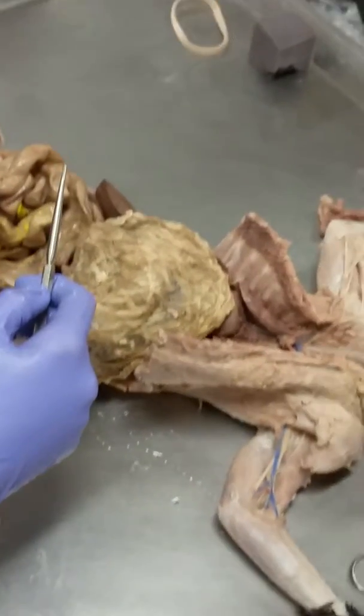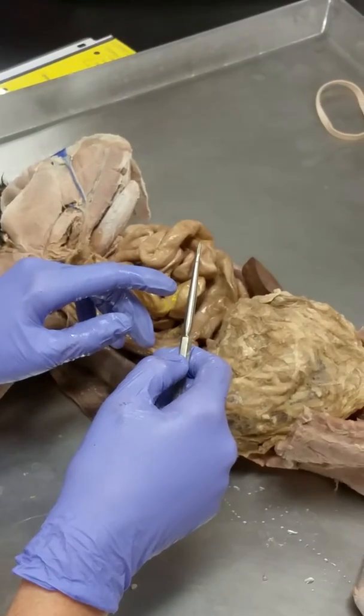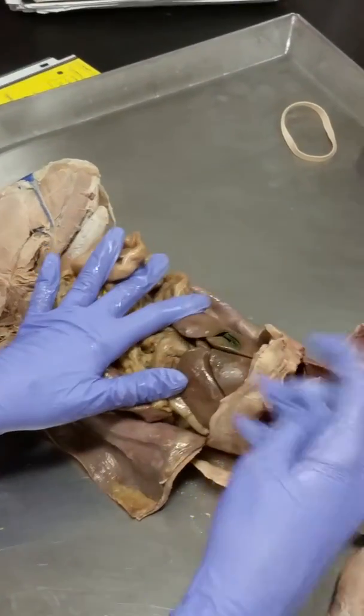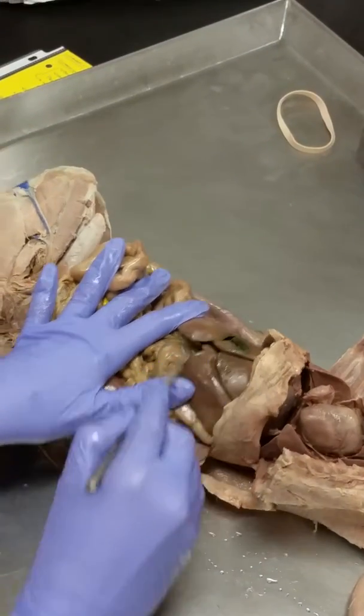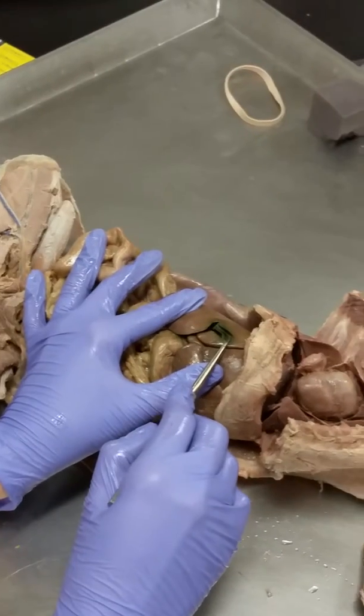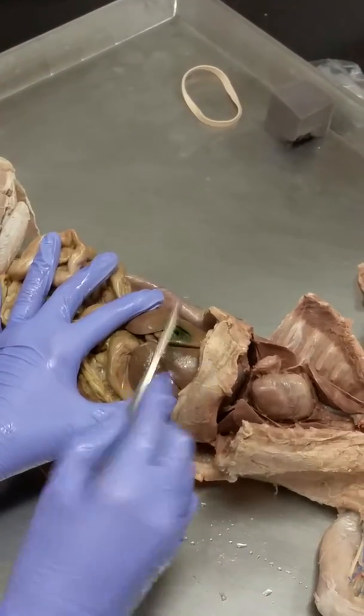Let's see. We did esophagus, gallbladder. Oh, we didn't do gallbladder. Okay. So if we look here in the liver, there's this green thing here. That green thing, that's the gallbladder. We have the liver, and we have the gallbladder, the green thing.